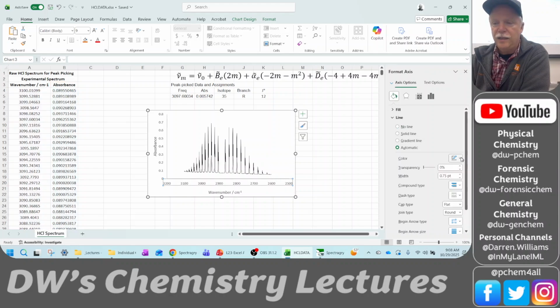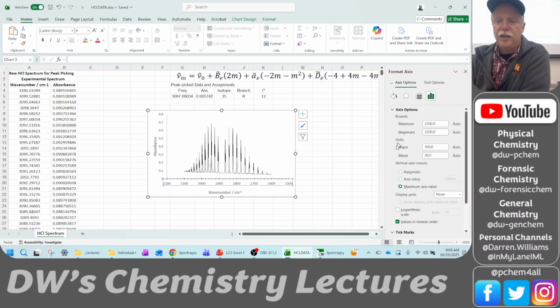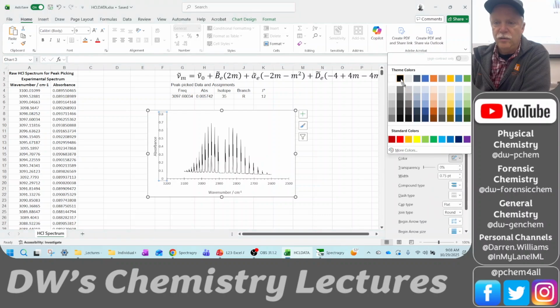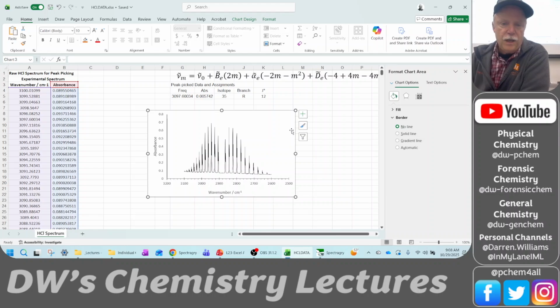Why Excel makes the axes gray instead of black, I don't know either. So let's get a little higher contrast on that. Come back over here and do tick marks. This is personal preference. I like to have the major ones cross and the minor ones be on the outside. And so there's our tick marks. Where the tick marks show up, this is the units, the major and minor units. And so you can change those if you wanted it every 50 wave numbers or whatever. Okay. And so let's take the y-axis too, and let's make the colors black as well. So they look a little bit sharper. All right, so that's our spectrum.